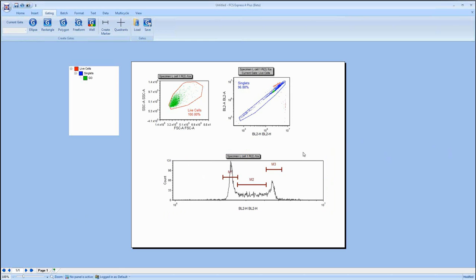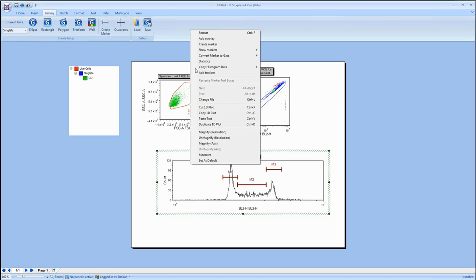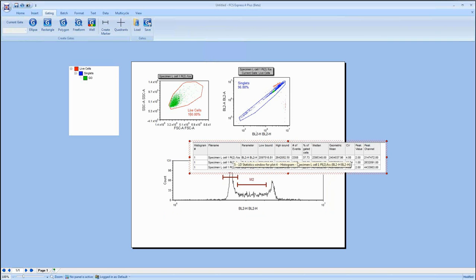Now, I took this layout a little bit further because in FCS Express we don't really want to set up markers for our DNA analysis. And the reason is we have the multi-cycle cell cycle analysis tool in FCS Express. So we have a way that's a little bit easier to start working with this data. Instead of just, say, right-clicking and getting statistics here for these three different markers and showing our marker name here. Marker 1 is 37%, so that's G0, S phase, and G2.